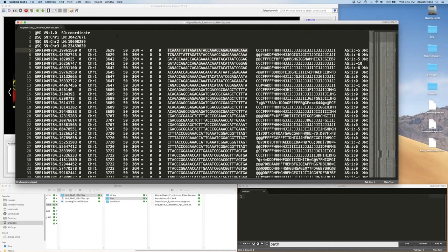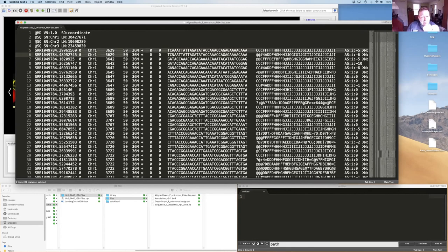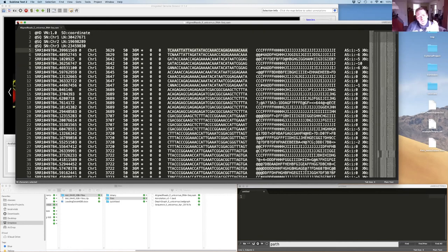The main things to know about a SAM/BAM file are that it tells you the position of the read, the sequence of the read, and the quality of the read. By taking the position and the read, IGB can place this at a particular location in the genome.